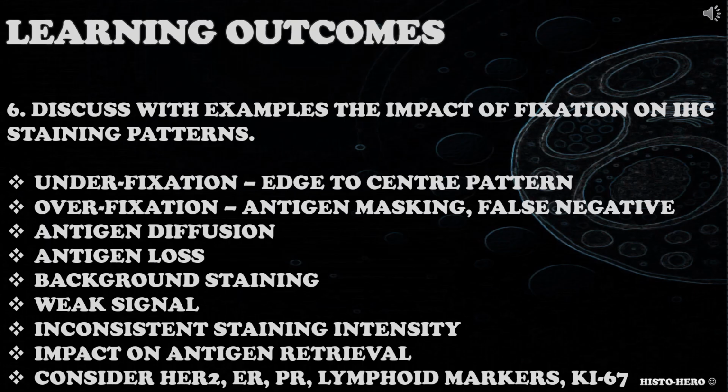How would you overcome those? Consider specific examples like HER2, ER, PR, Ki67 or lymphoid markers that can be significantly affected by fixation.